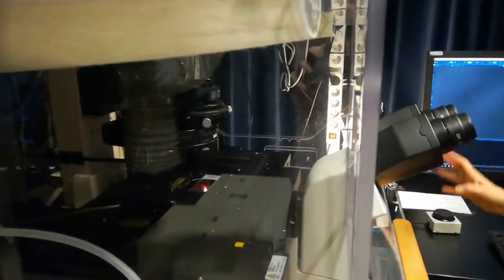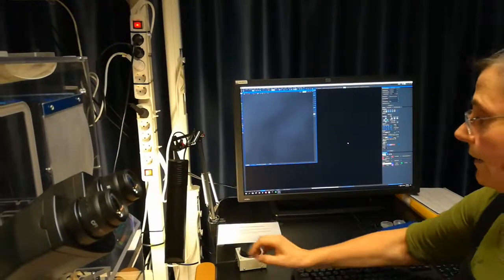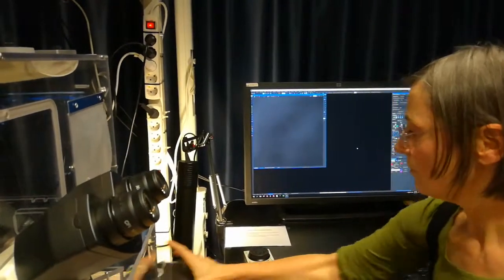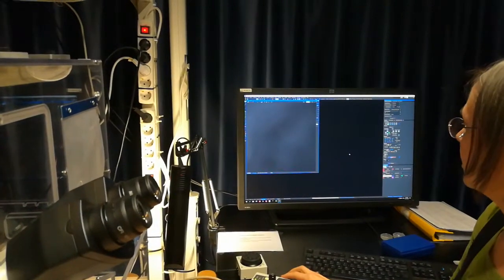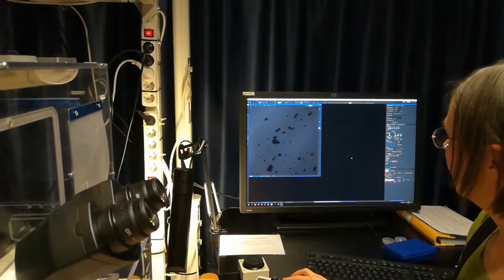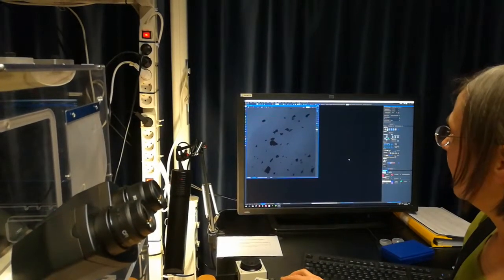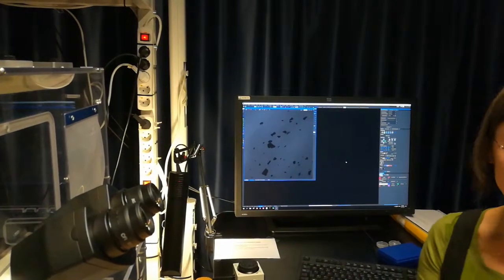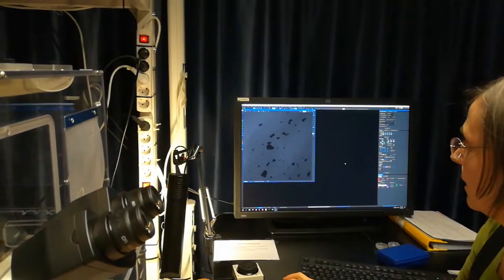The first thing we have to do is find the sample. I have an image on the screen and I can run the camera live, and now I'm going to focus so that I can get my image in focus. Here we go — we have something here, some sort of objects. So now that I am in focus, this is really the first step. It's a very important step. I am in focus for the objective.